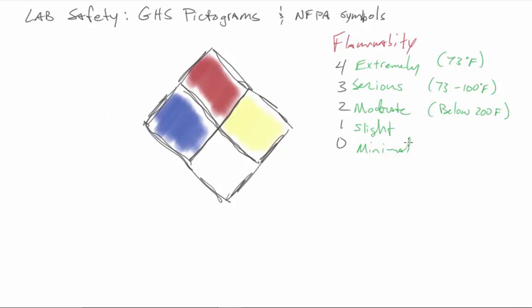All right, so with flammability, we'll be dealing with anywhere from 0, 1, 2, normally not 3 because we don't want something igniting at room temperature. So we're going to stay between the 0, 1, 2s is what you'll see. If you see anything 3 or 4, don't open that sucker up. And keep it in the fridge.